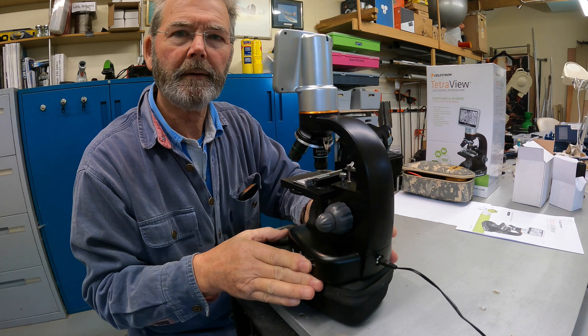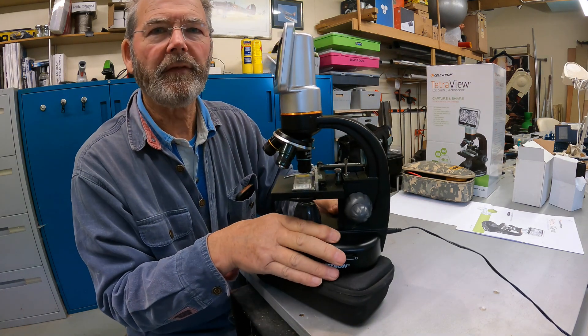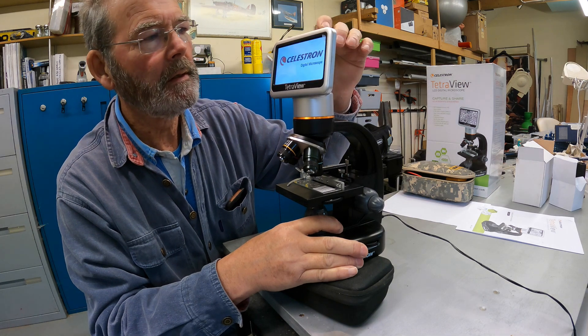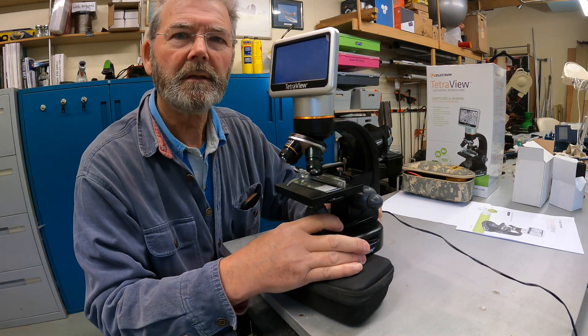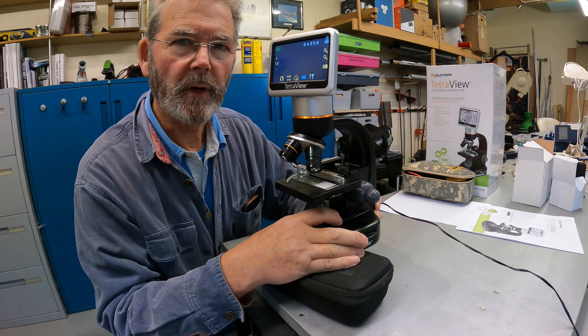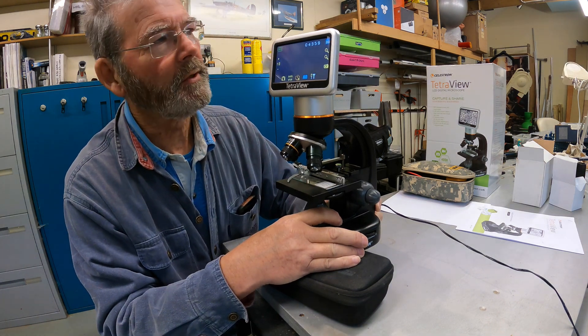I've plugged in the mains power at the back here and we'll see if the LCD screen comes on. Yes - so it's okay on mains power. It doesn't work on batteries, so we'll continue on that basis.